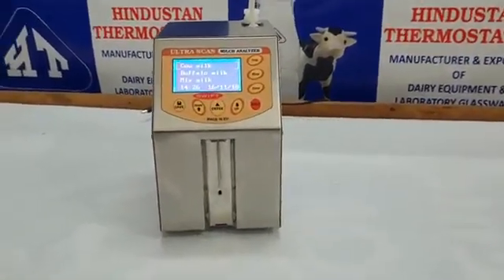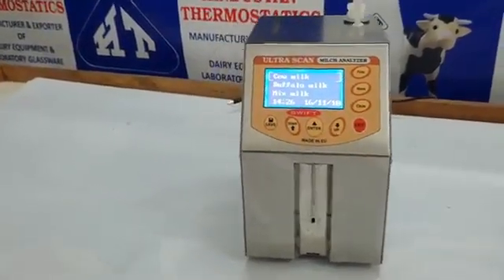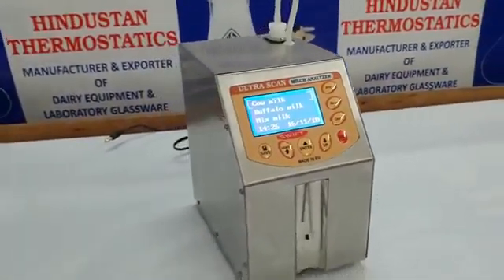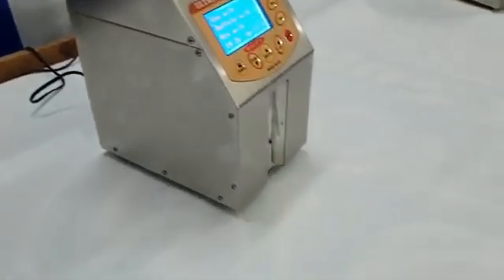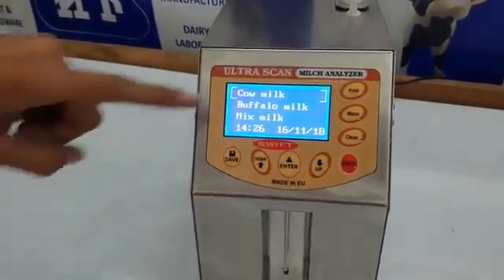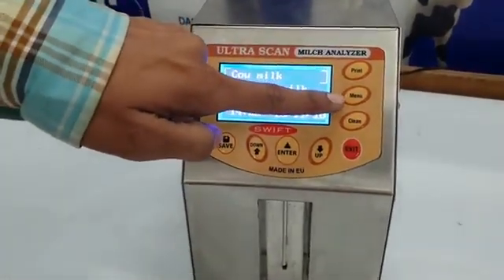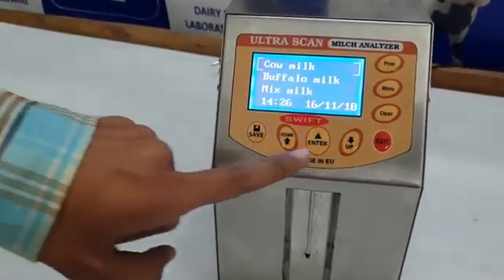Let's talk about the Ultrascan Swift model. The outer body is purely made of stainless steel 304 food grade. It features a bold keypad with all clear options on the board: Print, Clean, Save, Enter, and Exit.